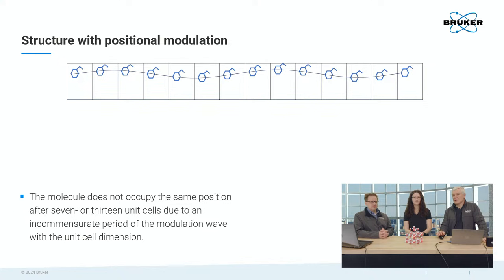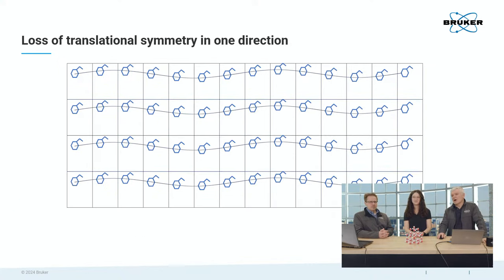of the repetition. Count to like 6, 7, you're almost at the same spot, then go to 13 and you're almost, you're not really there. Yeah. So you see it's not just an integer, it's really like an incommensurate number, basically, the relationship between those two. But it is something that does repeat. It's not a random interval. It's a repeating interval. It's a long-range order. Okay.